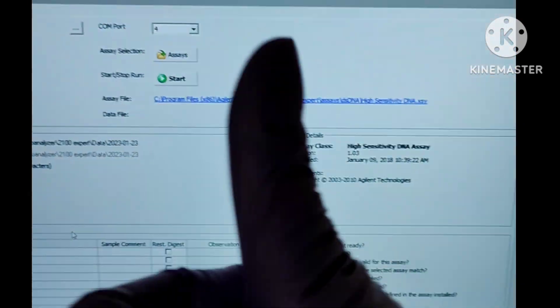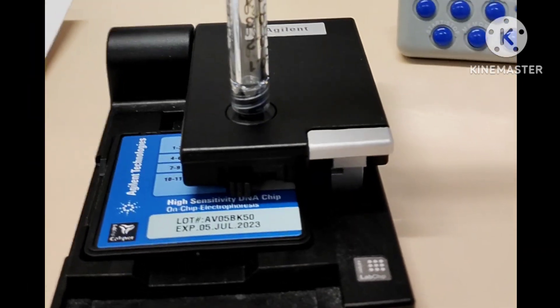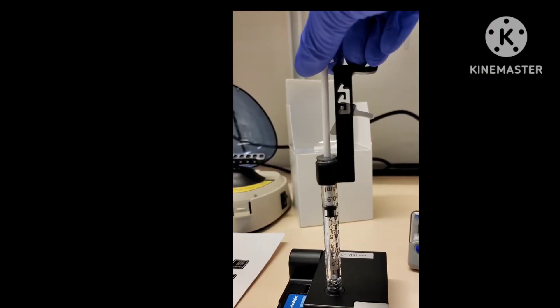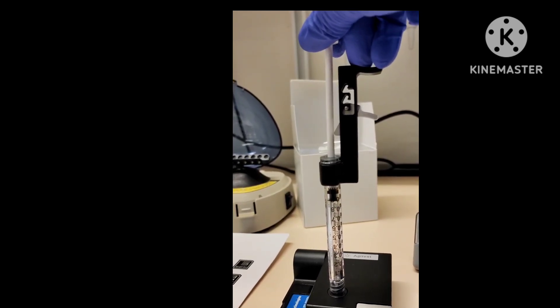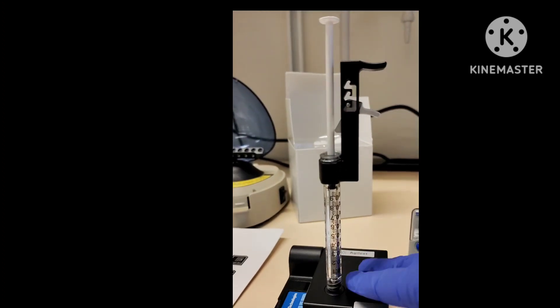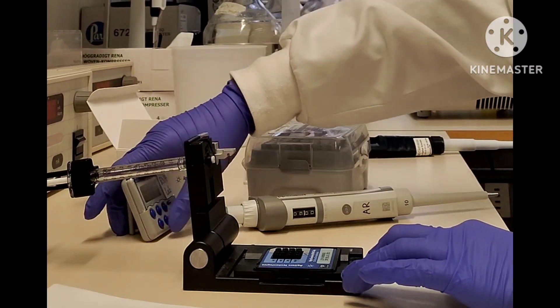Now let's come back to the chip. It's now more than 30 seconds, and you can see the plunger has moved back at least 0.3 ml. Now you can slowly pull the plunger back to the 1 ml position. Open the chip priming station.